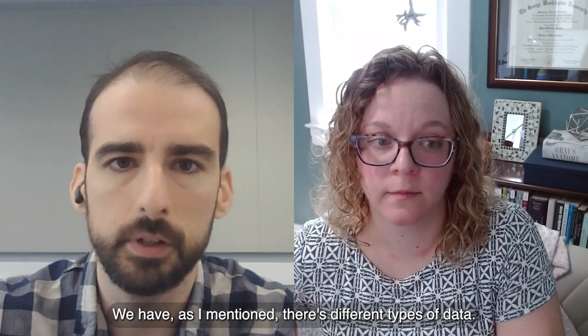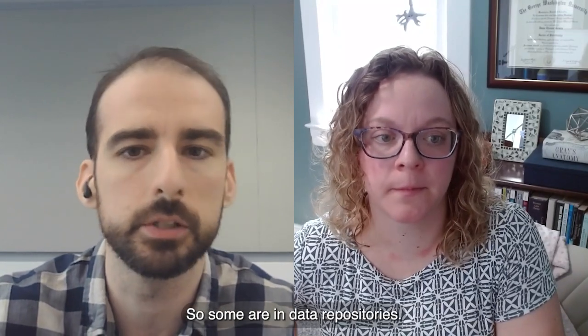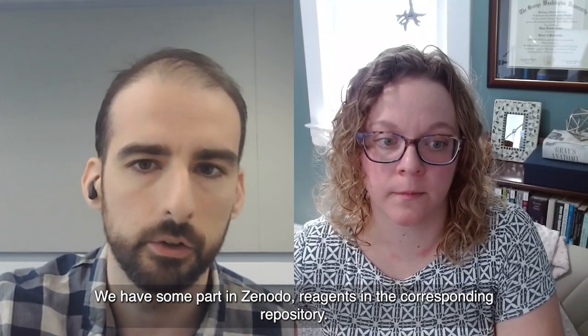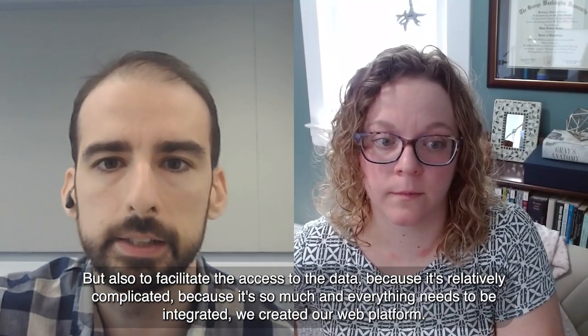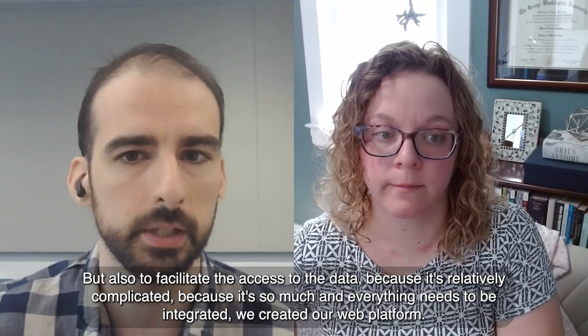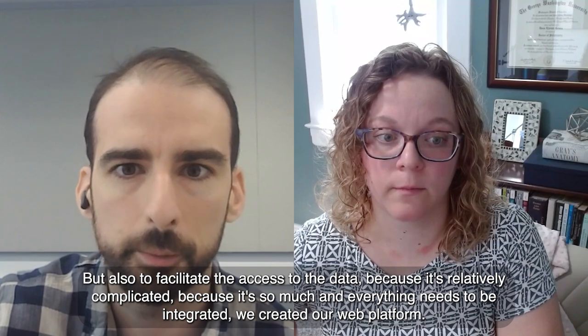As I mentioned, there are different types of data. Some are in data repositories. We have some part in Zenodo, and reagents in the corresponding repository. So everything is accessible. But also, to facilitate access to the data, because it's relatively complicated, since there is so much and everything needs to be integrated, we created a web platform.